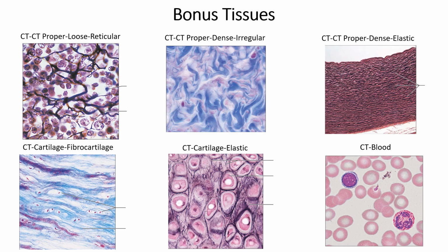We don't see any fibers, right? The fibers in blood are kind of dissolved. Blood will have some fibers, but not a lot, and what fibers do exist are going to be in a dissolved state until they need to condense and become more solid. And then we see a lot of cells. So all the pink or the purple larger cells or structures here are cells.